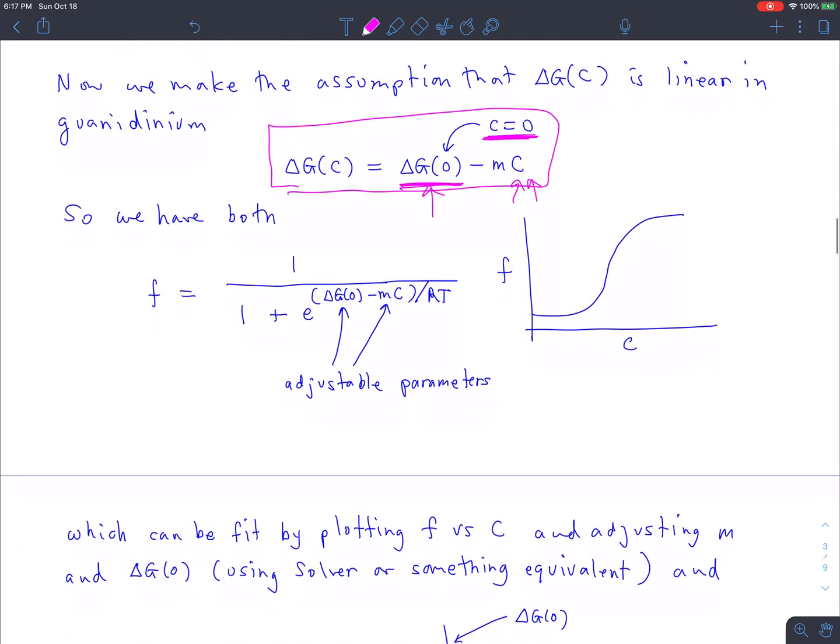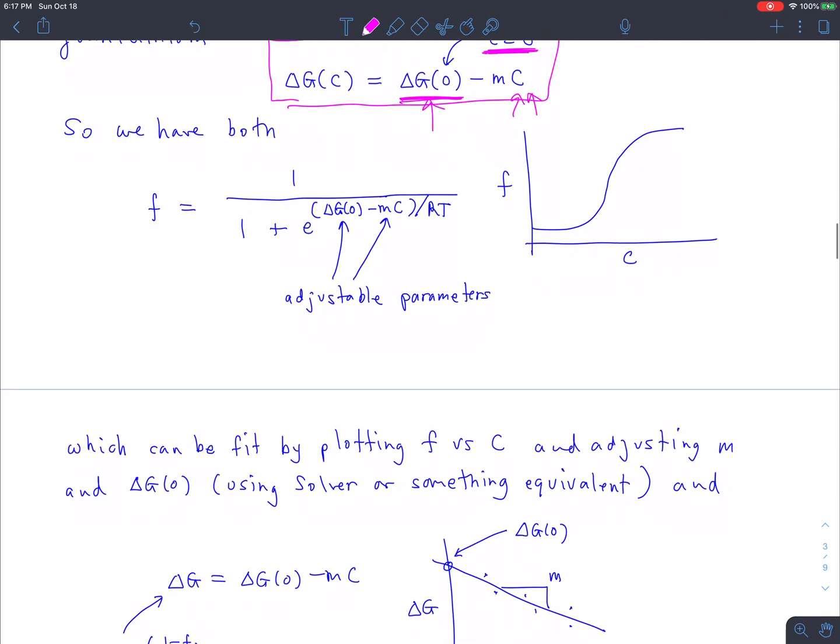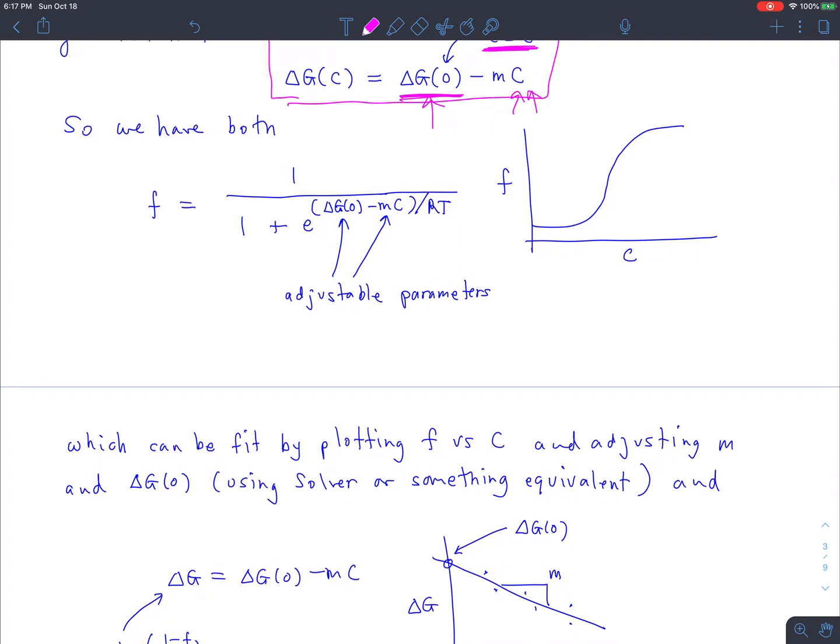All right, so we can do two things then. We're going to analyze our data in two different ways. We'll of course talk more about the analysis next week, but for this week we'll say just a little bit about it. Here's one relationship, right? We have the fraction of stuff that's unfolded as a function of delta G, this delta G0, this is the quantity we want.